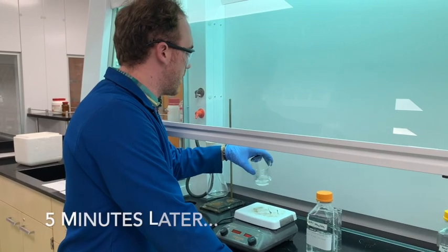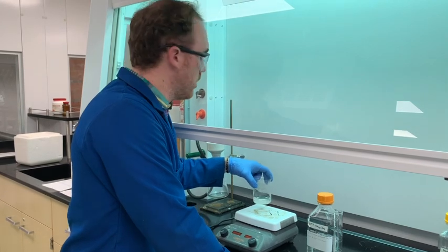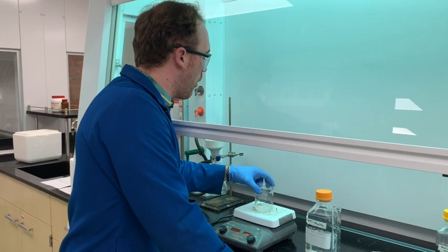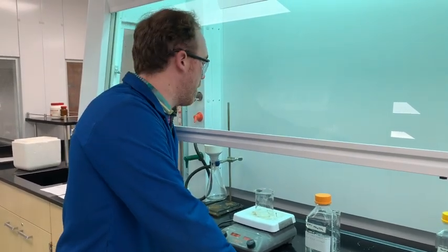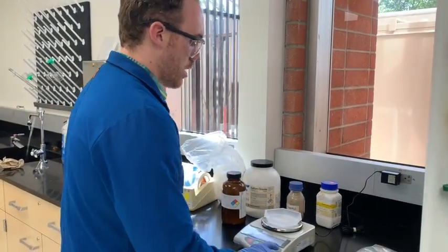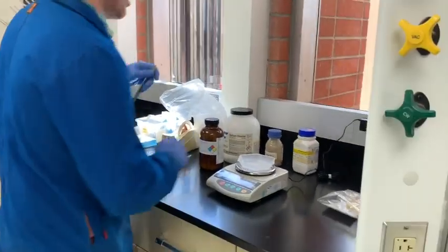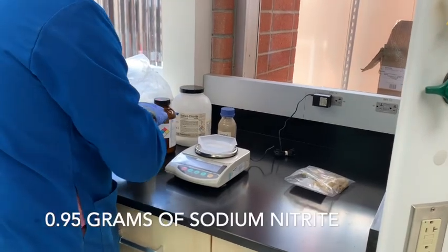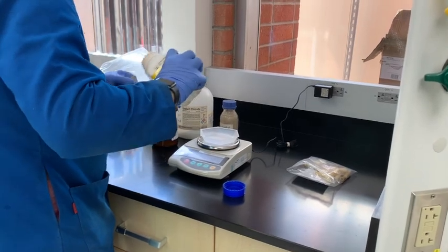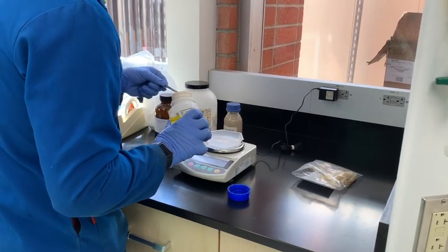Alright, so let this sit here for a second and added a little bit of heat to it, but mostly it dissolved all on its own. And now we are going to, in the meantime, weigh out some sodium nitrite for mixing into this once it actually fully dissolves. I'm going to grab this new weigh boat and zero it out. And then we need 0.95 grams of the sodium nitrite. So let's see what we can do there.